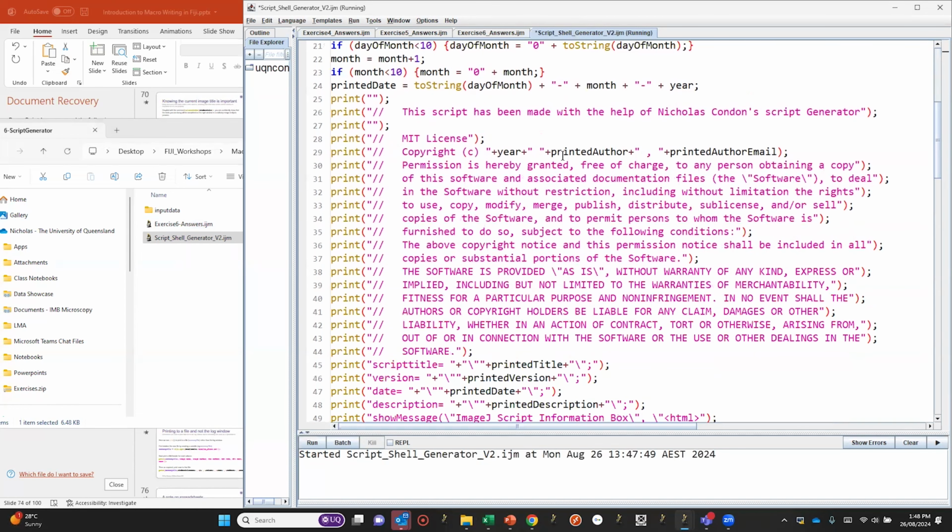Something that I've done is I've put a license. Now, I don't have slides on licenses with your scripts, but suffice to say, you might want to make sure that you pick the right license. I generally use the MIT license. You can Google these. There's GNU licenses. There's all different ones. They have slightly different caveats, right? So you might want to try to protect your work.